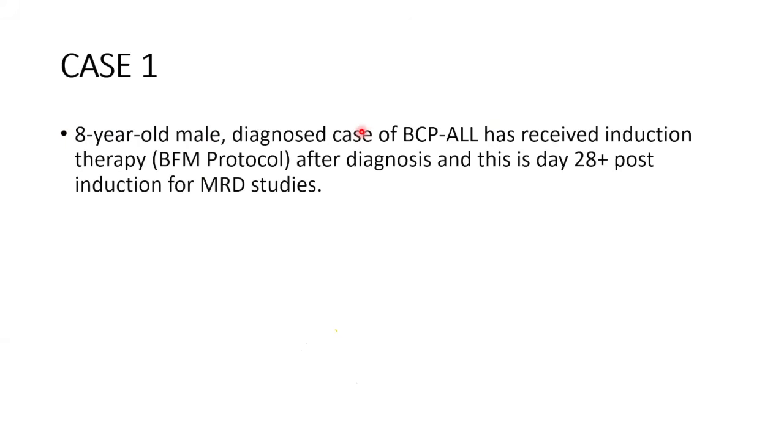So first, with the case, I will show you the different patterns of maturation. I'll show you the various markers, how they are contributing in seeing the patterns of maturation, and along with that, I will show you the expression of the LAIP markers that are seen or that are not seen in all the normal staged precursors or hematogone levels.